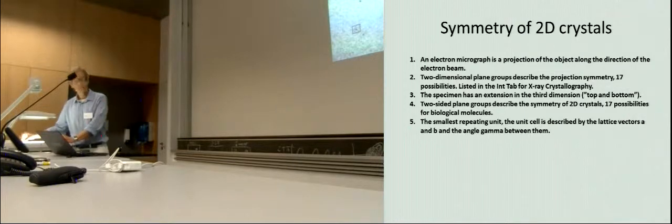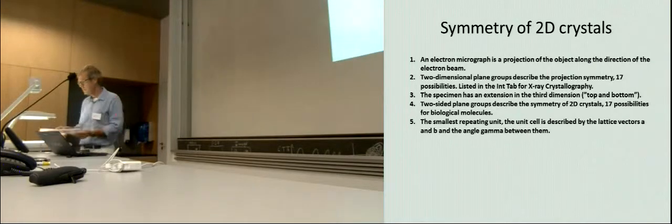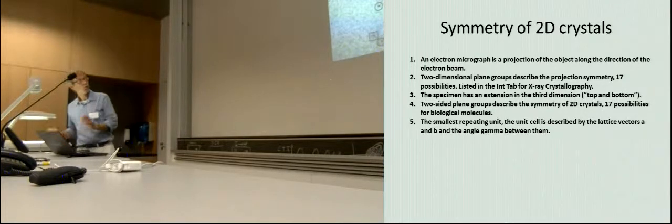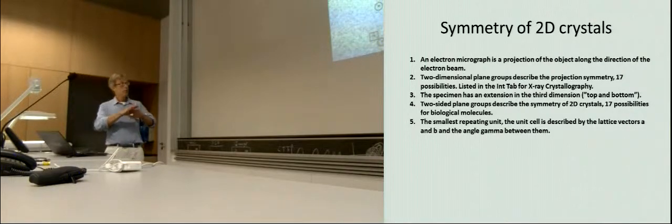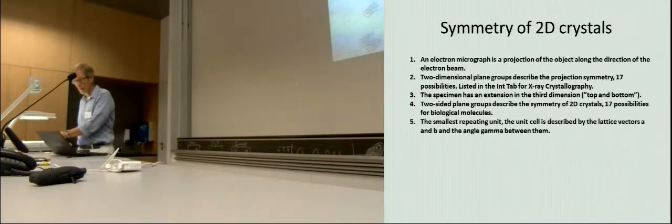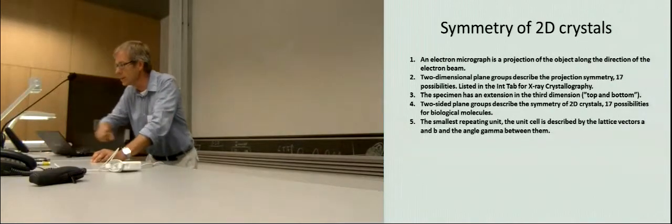And then if you rotate almost 90 degrees, you can find the other spots, the other lattices. And in summary, we have two lattices which are rotated almost by 90 degrees. So this is a tubular crystal with crystal orientations which are almost 90 degrees apart from each other. Okay, so let's switch back to the modern technology.